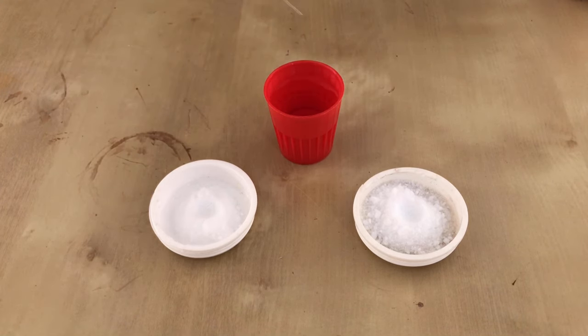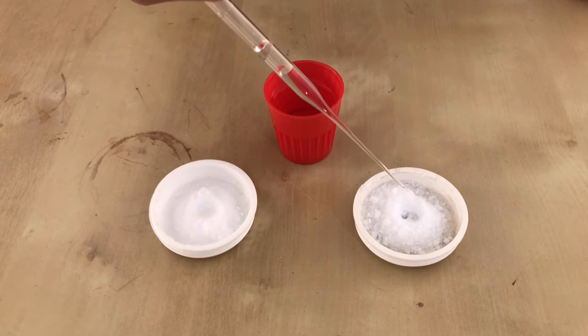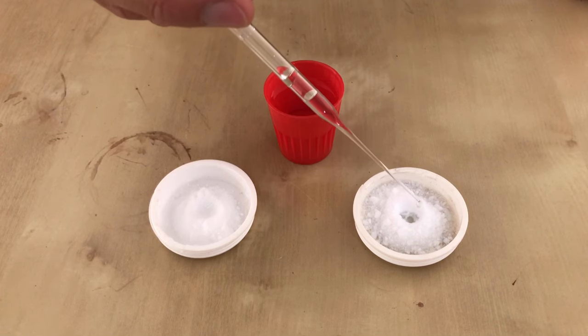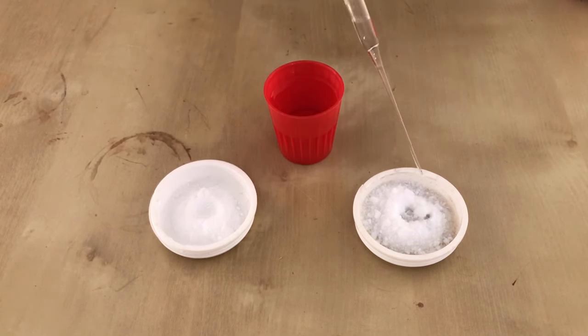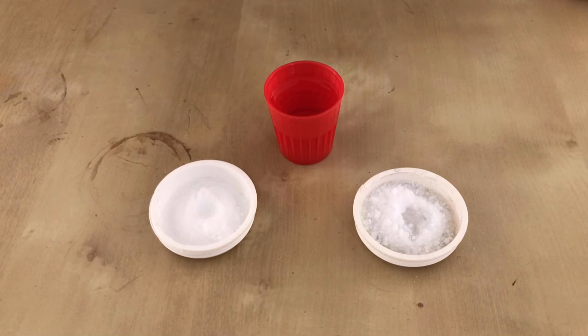So let's give it a try. This is some distilled water, and we are going to add it to this fumed silica. As you can see, it's immediately being sucked up. It actually consumes a lot of the water. I didn't want to make dust, but I guess it can't be avoided.